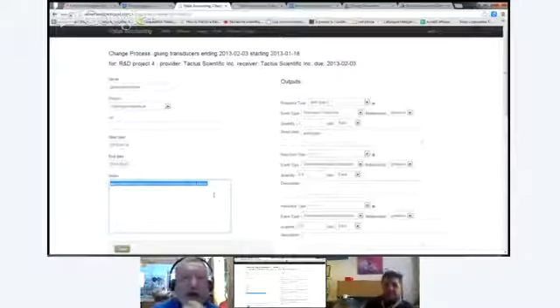I think Francois had a question. Yeah, me too. I'm interested in using the lab notes right now. But is it safe, or do I have to copy my text somewhere else? Well, there's a place where I can put a lot of notes, where I usually describe my experiments. You would do that on the lab notes page. The lab notes, yeah. That's it.